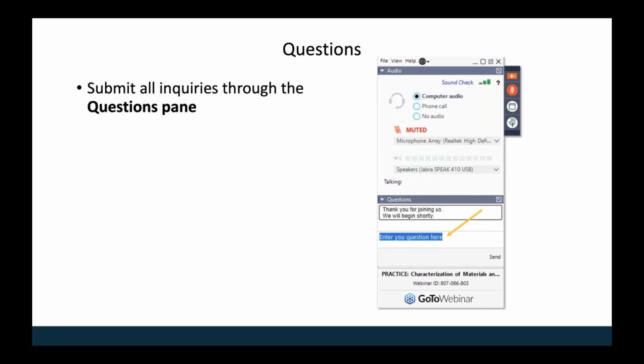A very interesting question just came in. Have you guys explored energy filtered 4D-STEM with biological samples? I personally have not, but I think it would be, depending on the sample, really helpful because these tend to be thicker, as long as it wasn't too thick. I don't know, Colin, if you have anything else that you'd like to add.